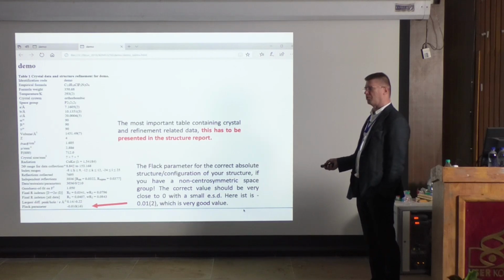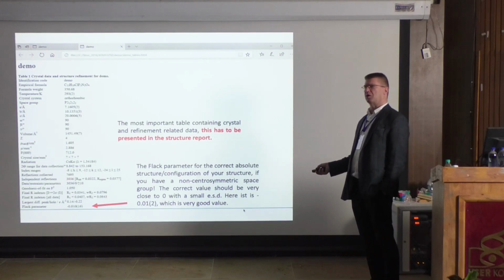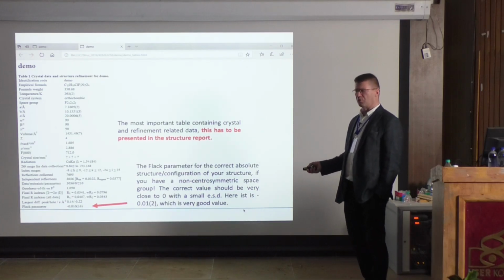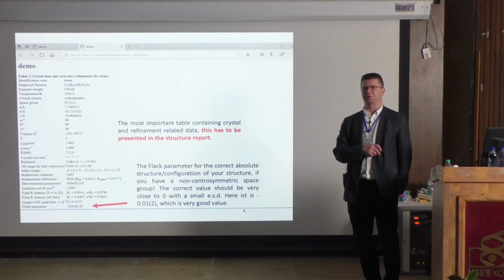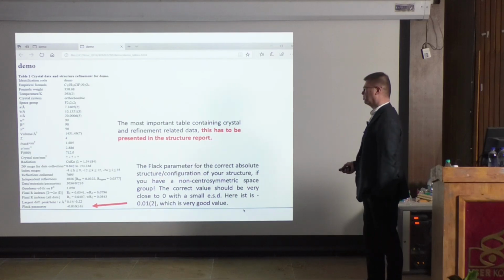But the point, if you look at the mathematical calculations, what it's doing, it is using all these 210 parameters in each of these reflections. So it's a huge calculation. I remember a time when we had slow computers, actually not PCs. So this kind of calculation, what I was showing you yesterday, took a second or so, but then it took hours, because it's a computer which is doing these calculations. There's a huge amount of calculations. But okay, that's the idea.